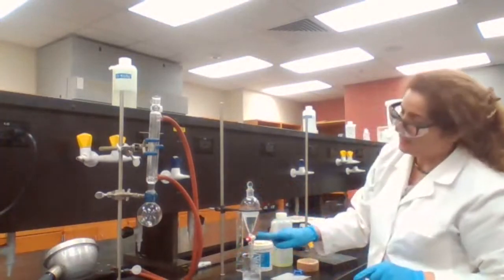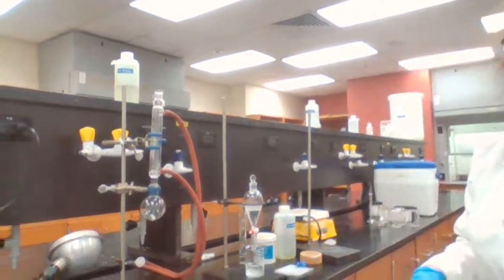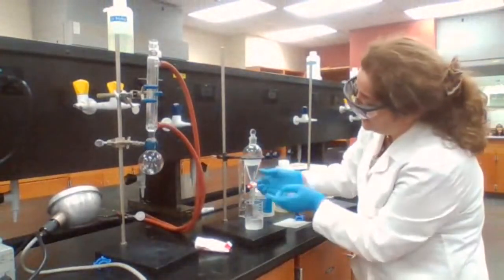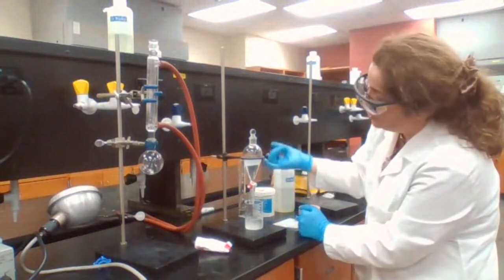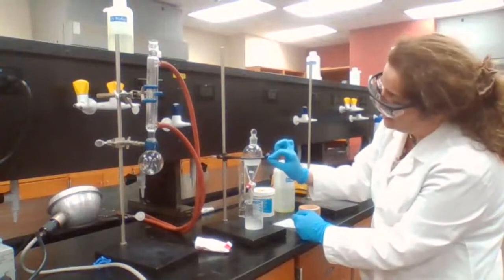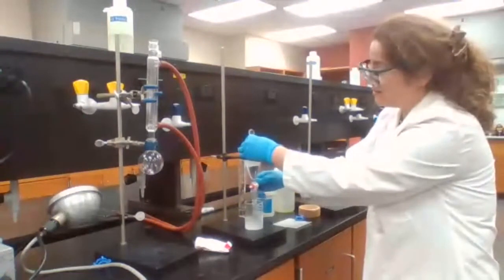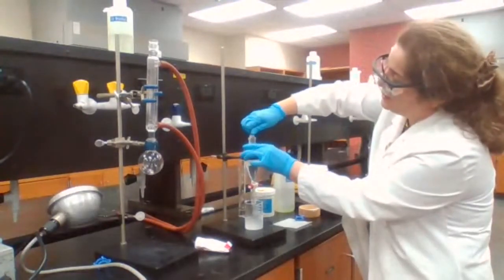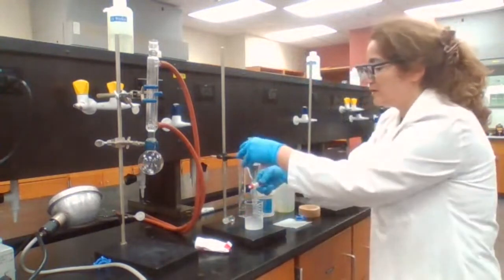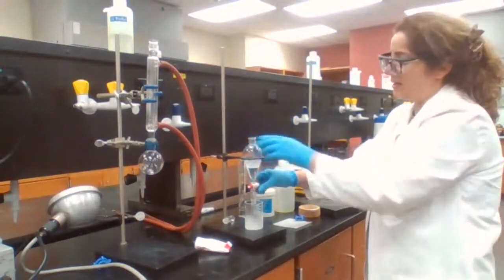See what happens if I don't take the cap off and I try to drain it? Even though the stopcock is open, nothing comes out because it creates a vacuum. It's kind of choking and trying to get air from the bottom, and it's going to destroy the equilibrium of the two layers. So for the right technique, you take the glass stopper out first before you open the stopcock.